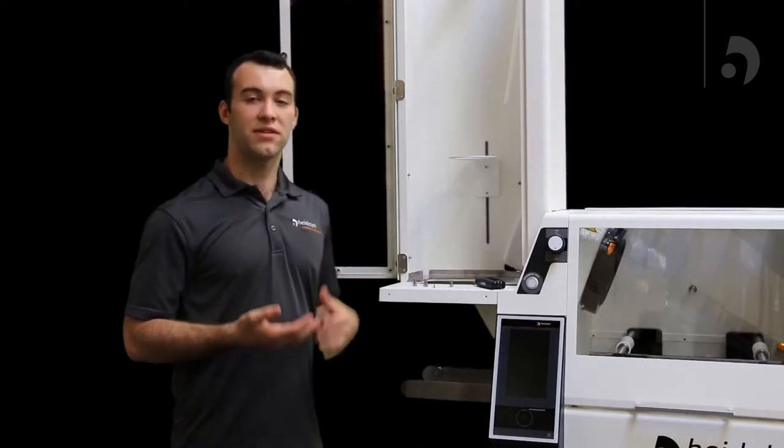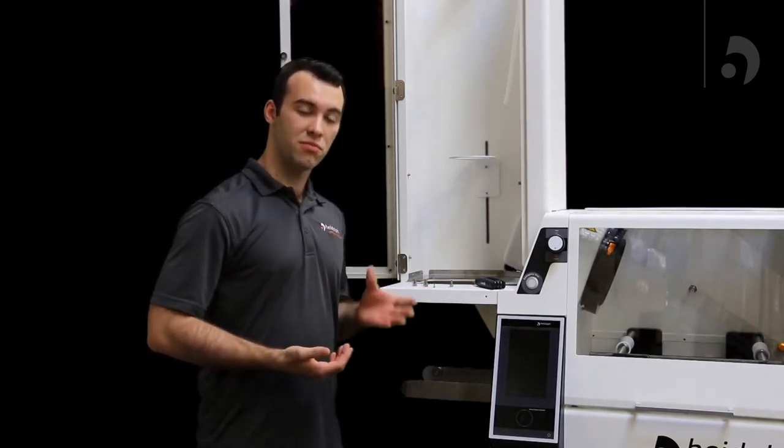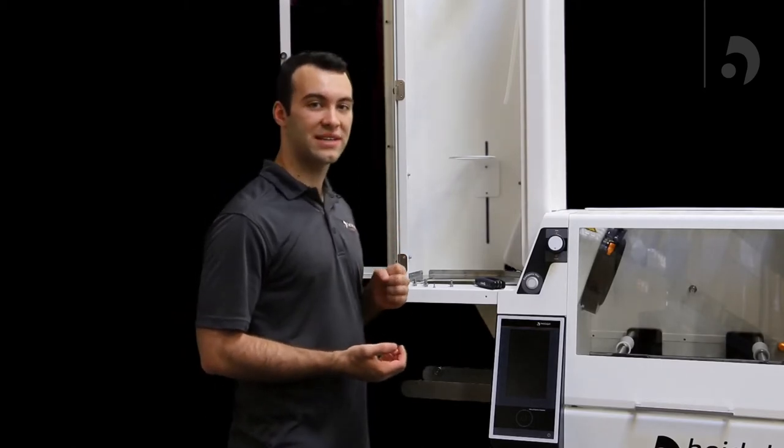Once you've done that, you're going to find the five screws plus the small screw that came with the housing, and we're going to start screwing those in.